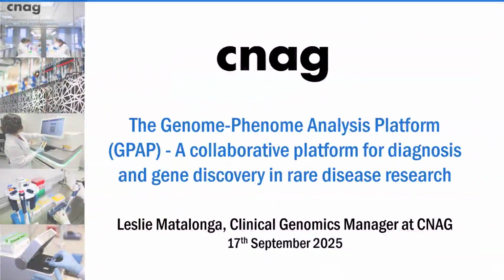This one will be more focused on maybe infrastructure and how we also apply genomic data analysis, and we integrate phenotypic information for downstream analysis. I will be focusing on rare diseases, but just give also at the end a very short introduction on the application for cancer. As you will see, the platform can be tailored a bit on different use cases.